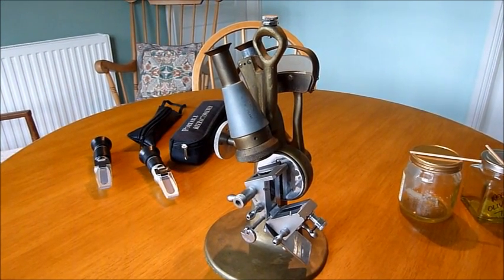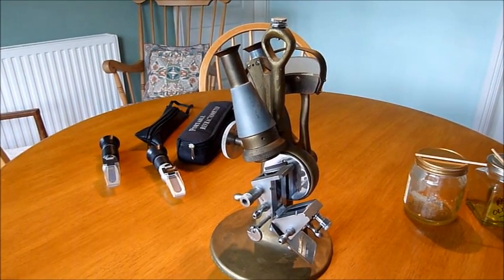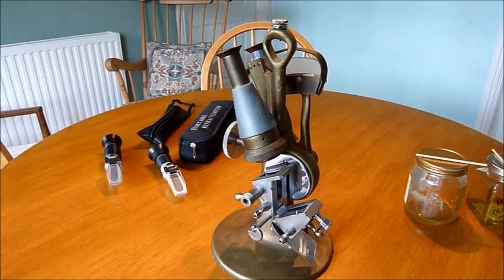The basic principle of a refractometer is quite simple. Different substances bend light to varying extents. You can use this to determine the concentration of that substance.